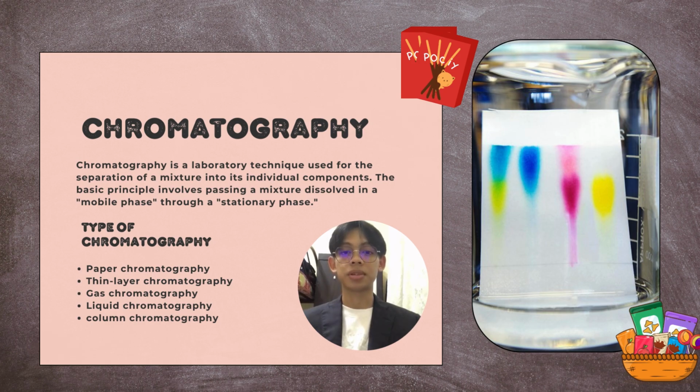Chromatography is a laboratory technique that is used for the separation of a mixture into its individual components. The basic principle involves passing a mixture dissolved in a mobile phase through the stationary phase. There are types of chromatography: paper chromatography, thin layer chromatography, gas chromatography, liquid chromatography, and column chromatography.